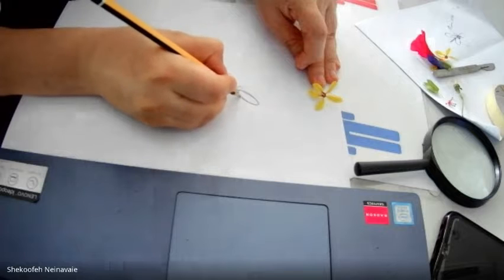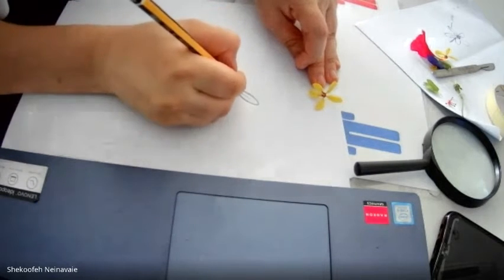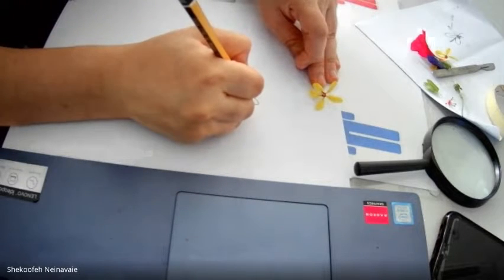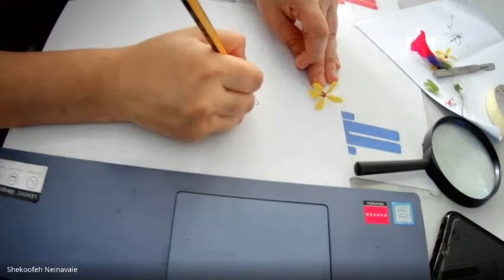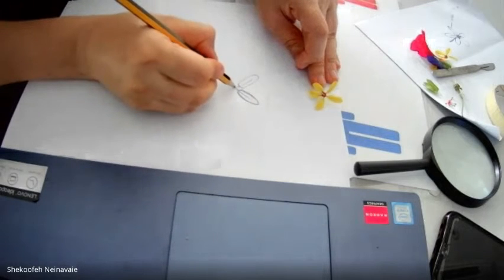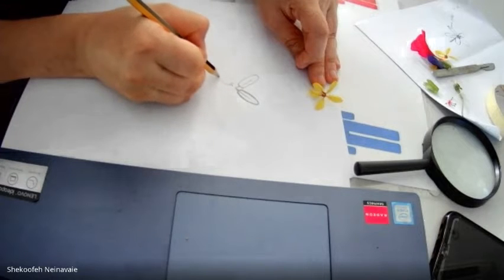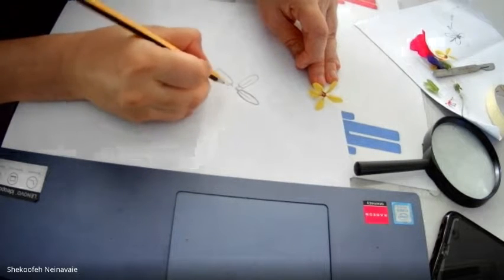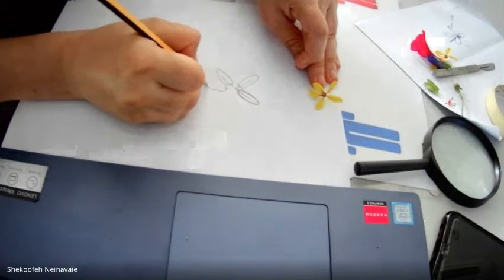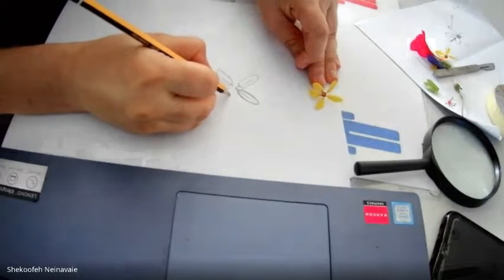At the base it is not rounded. If you have an eraser, you can erase it. So at the base, it is like this. This one also continues into the body of it. So another petal, again, at the base, it is a bit wide, then a bit narrow, goes off. At the tip, it is rounded. Then this part continues into the whole body. Again, another one originates from this part with a smaller stalk at the beginning. And then again, the same thing, and it goes for the fourth petal, and also the last one.